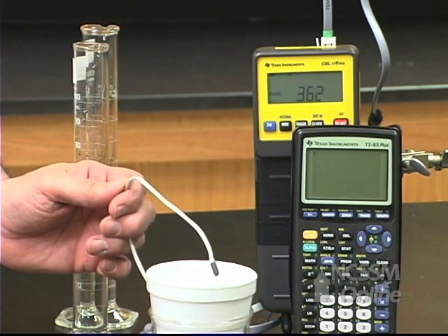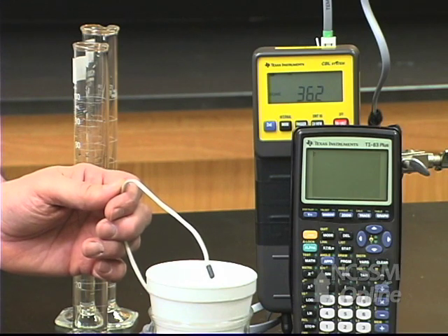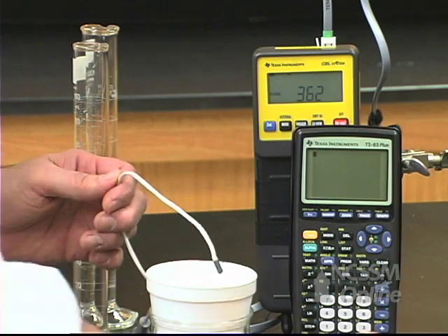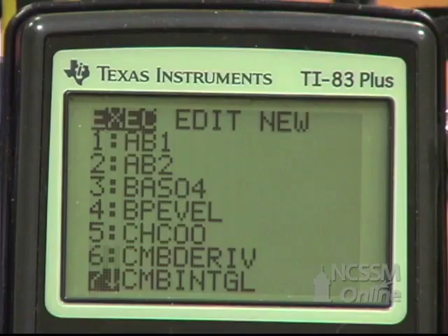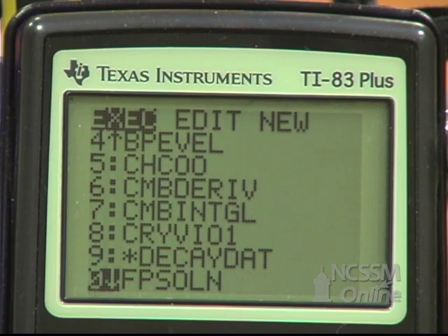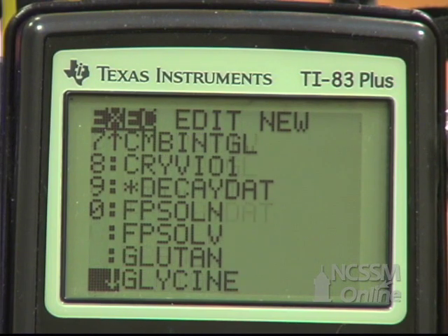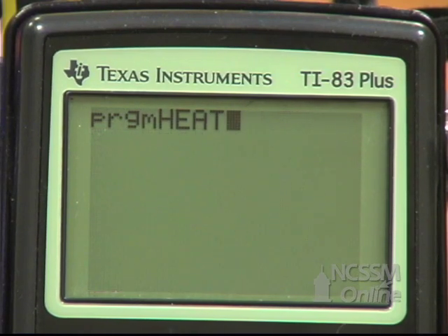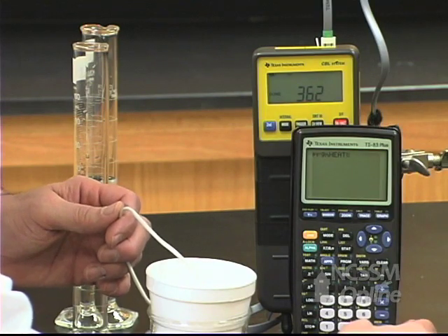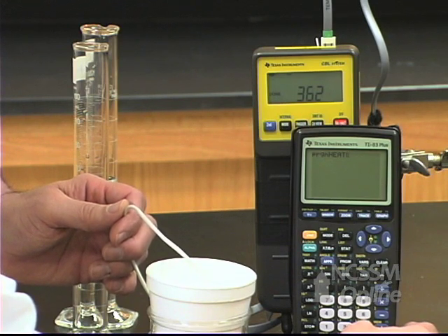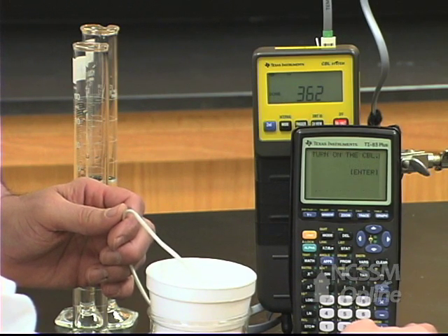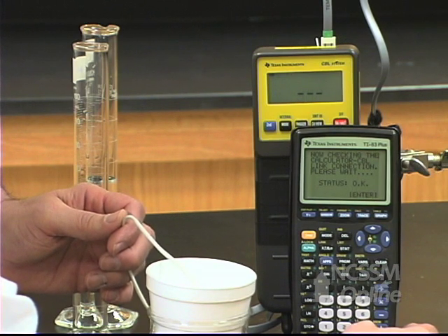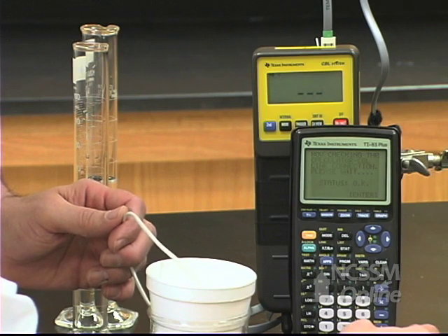We're going to measure the change in temperature using a CBL probe. We're going to use the program heat on your calculator. To start the program, press program on your calculator. Arrow down until the program heat is highlighted. Press enter. It's going to tell you it's going to run the program heat. It's checking to make sure you've turned on the CBL and that the connections are correct.